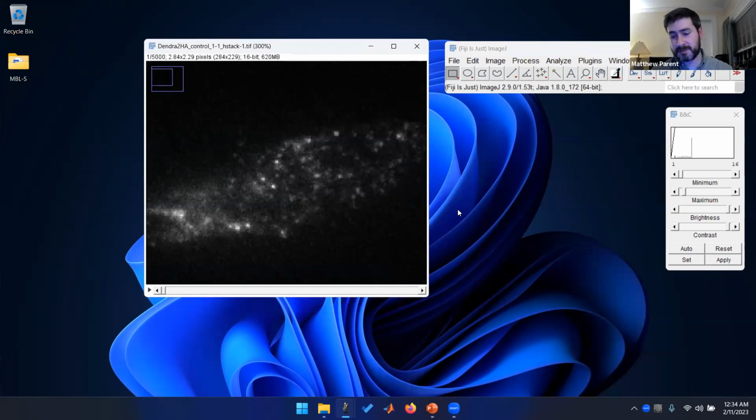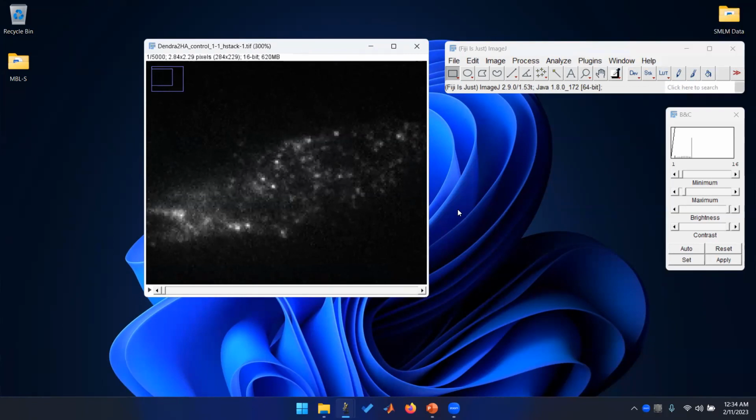And you don't always want to subtract background either. If your background is really low, remember in the Gaussian fit we have a background term. If the background is locally flat, you probably don't want to remove it, because you could introduce other artifacts by removing the background. But if you have very structured background, it's important to remove. Okay, thank you.